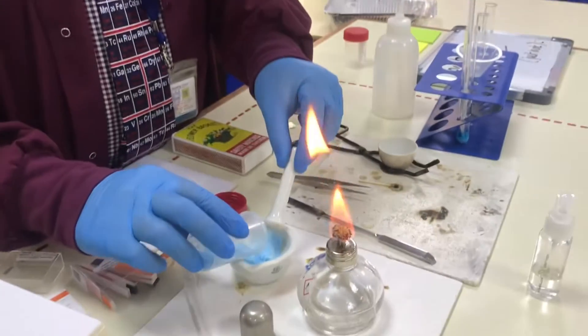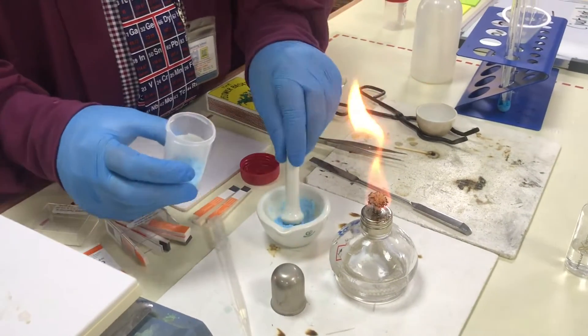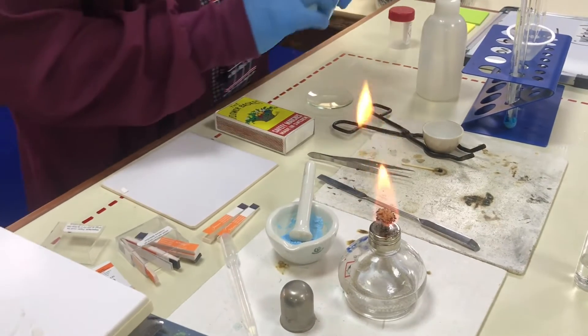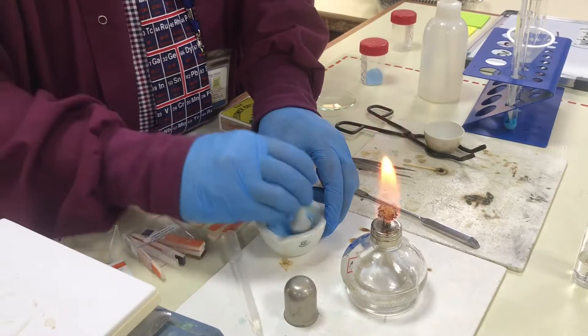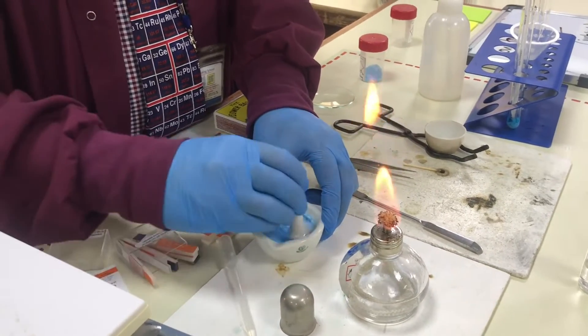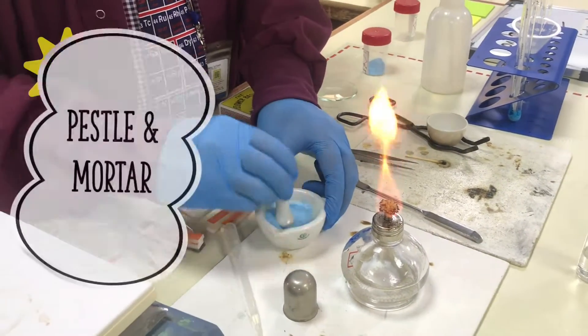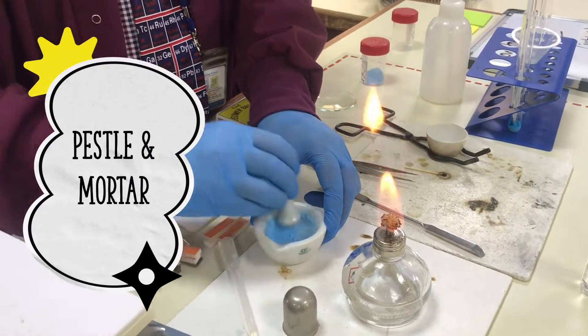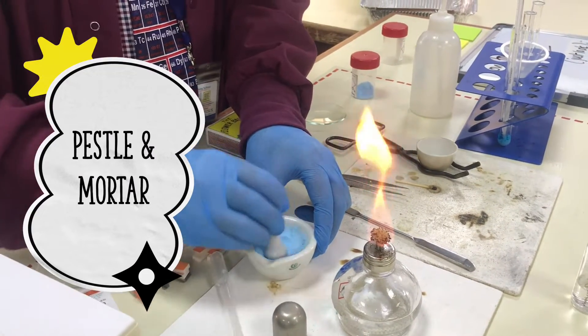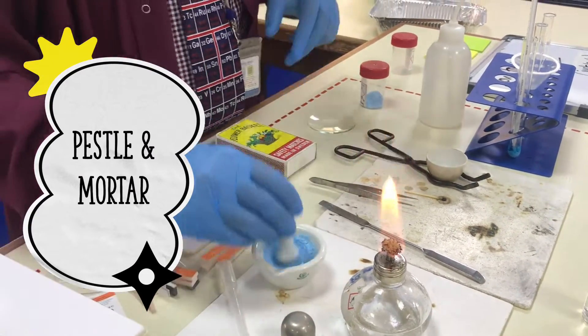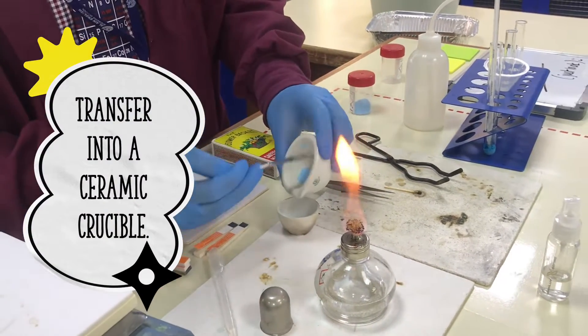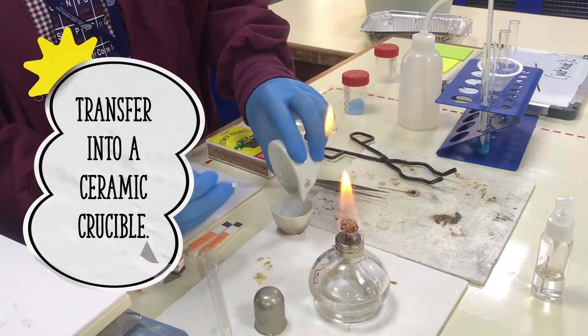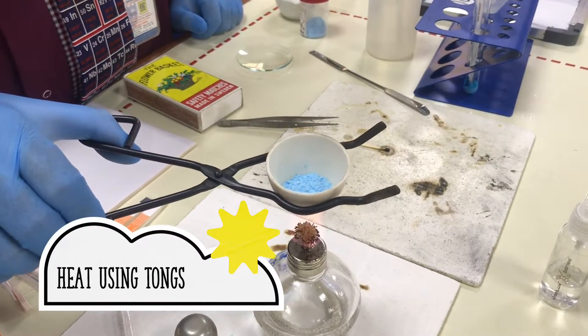I'm going to place it into a mortar and I'm going to use a pestle to pound the copper 2 sulfate to get it to very fine sized grains. It takes a bit of time.